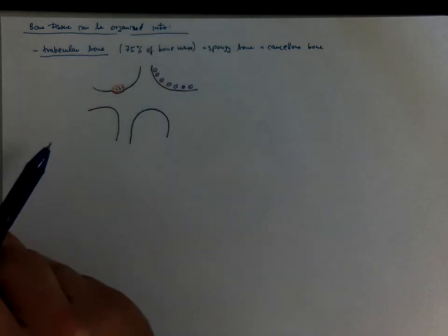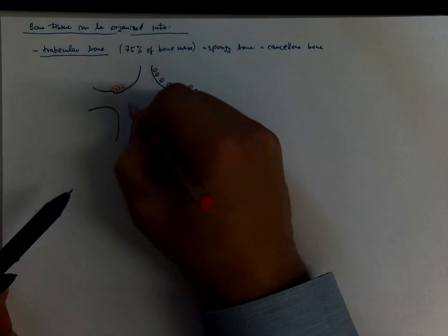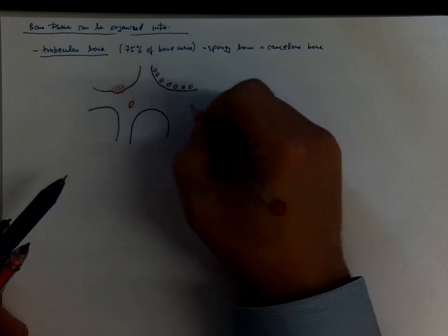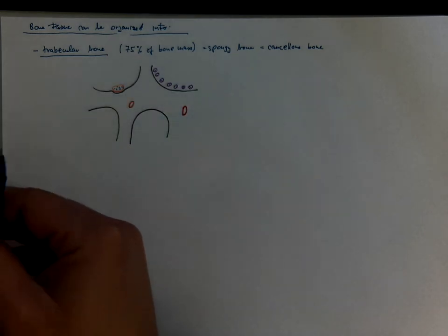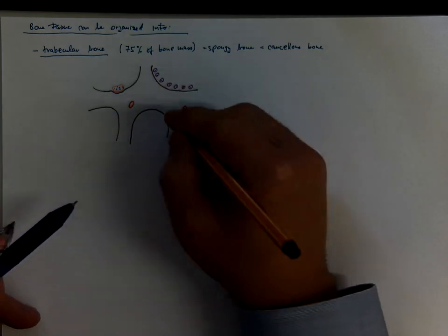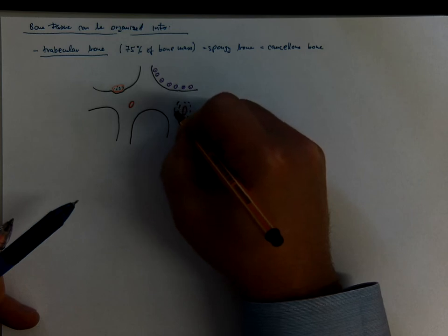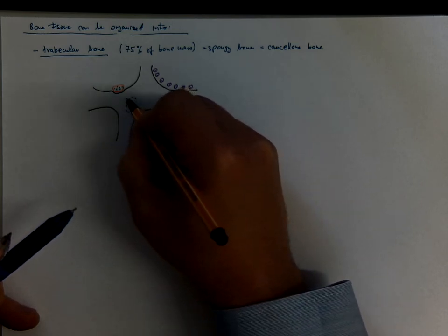You can find the vascular canals, surrounded by the lamellae of extracellular matrix and layers of osteocytes.